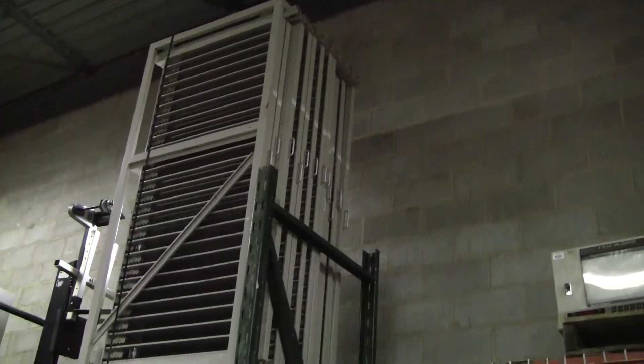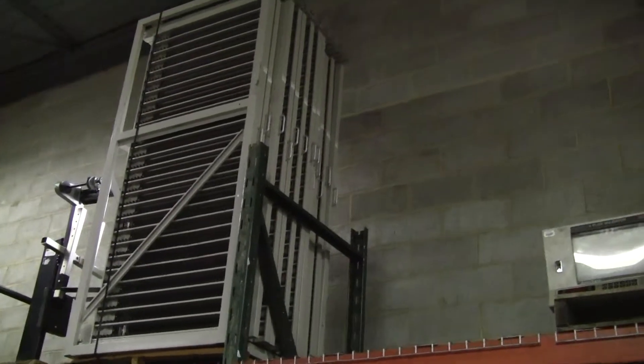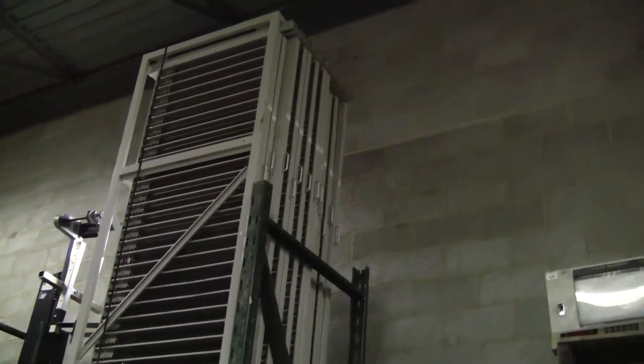Hi, this is Jim from HitechTrader. Today we're looking at a GemTrack sample vial storage rack. It consists of 18 sliding racks that slide out on the side. You can see the handles to slide them out. Each rack has 26 rows, each row holds 36 samples. That will be a total of 16,848 vials.